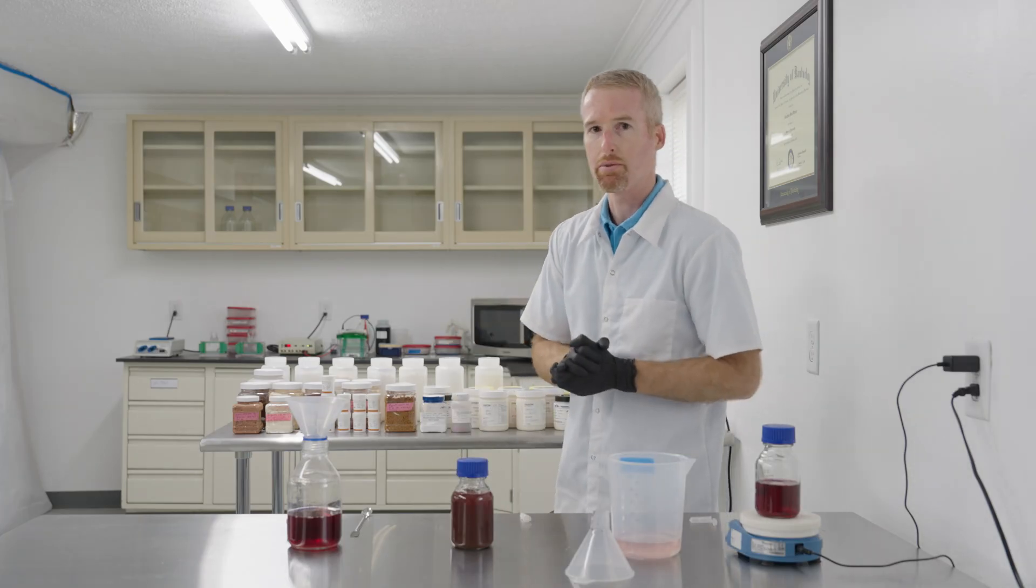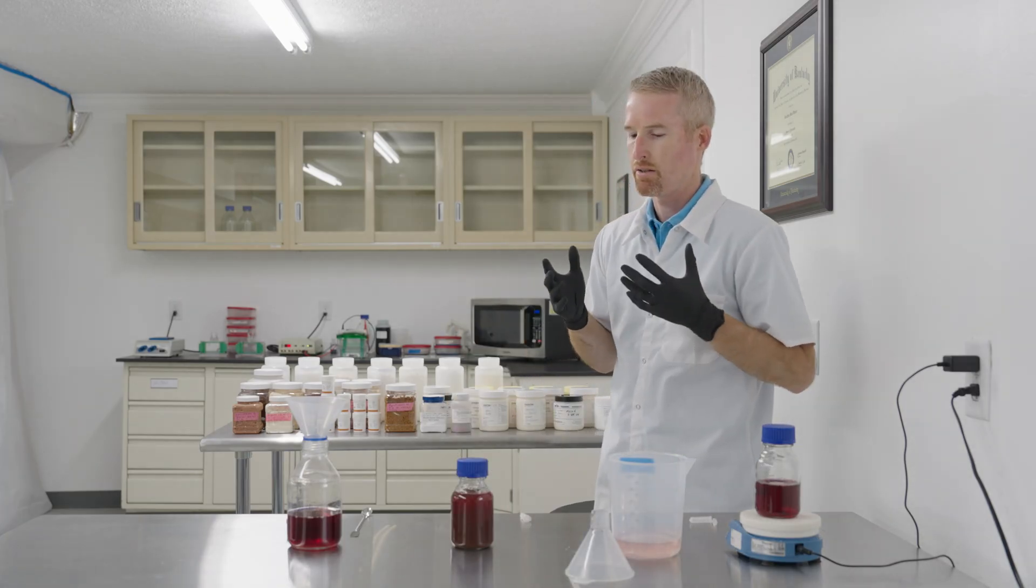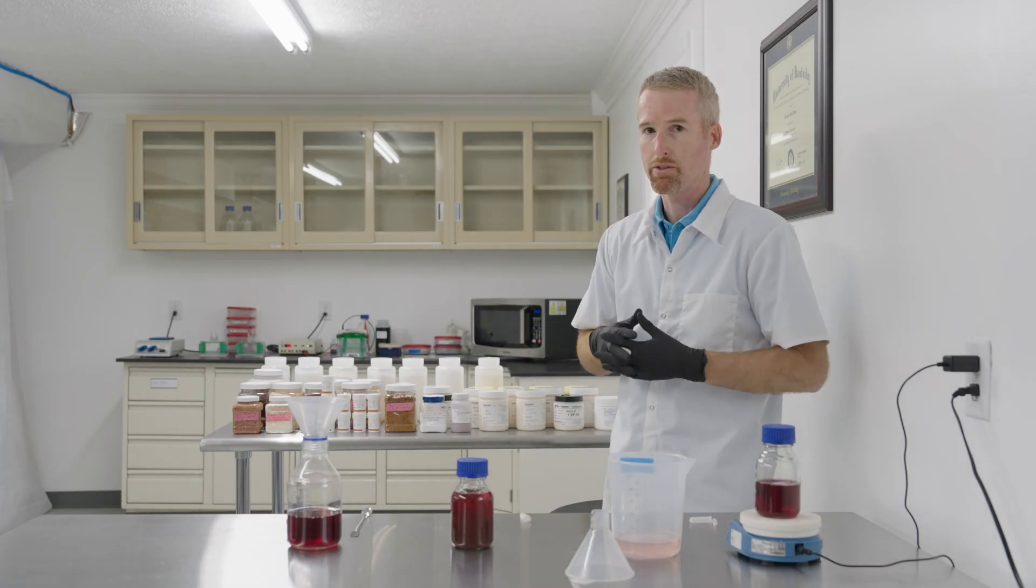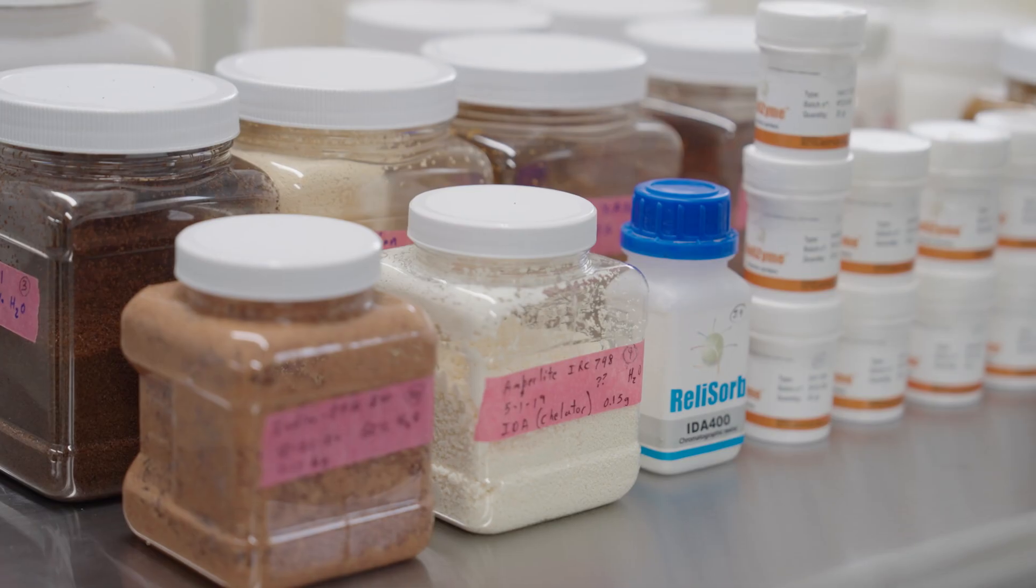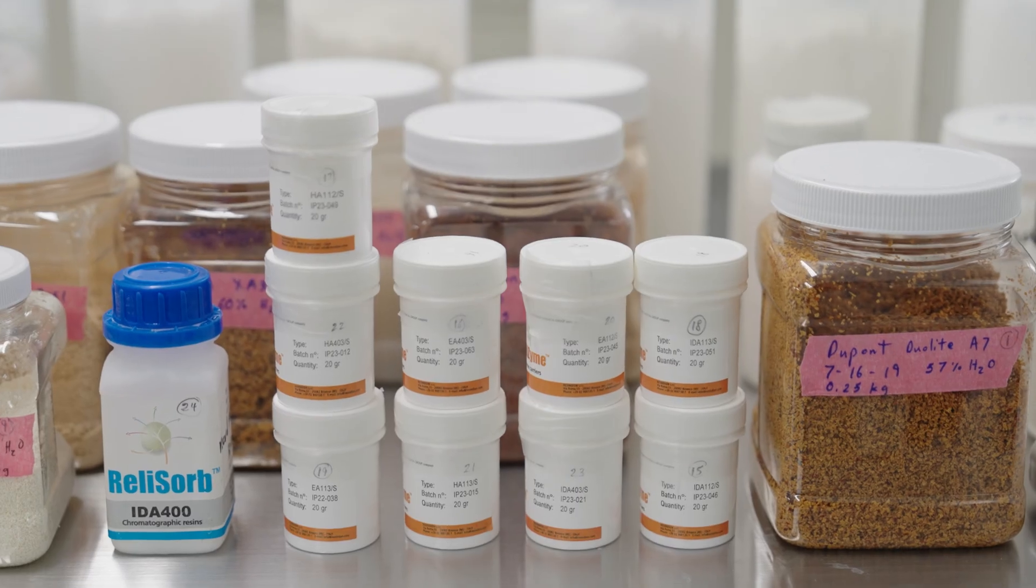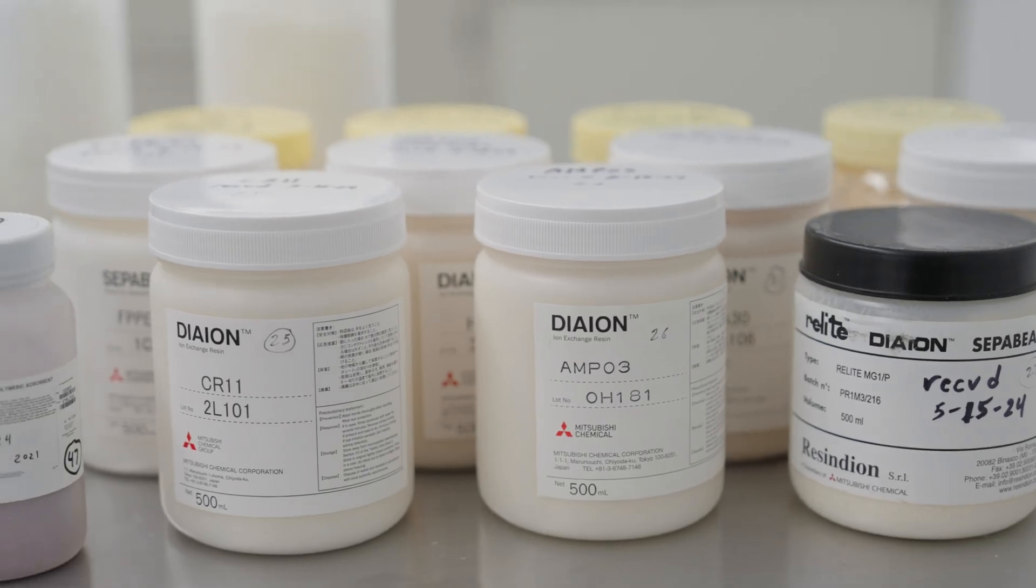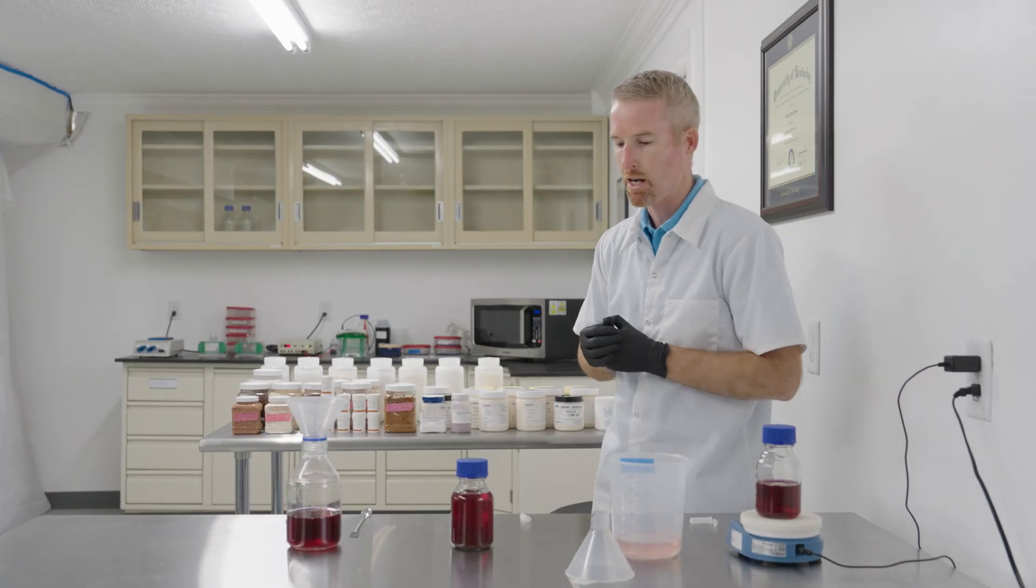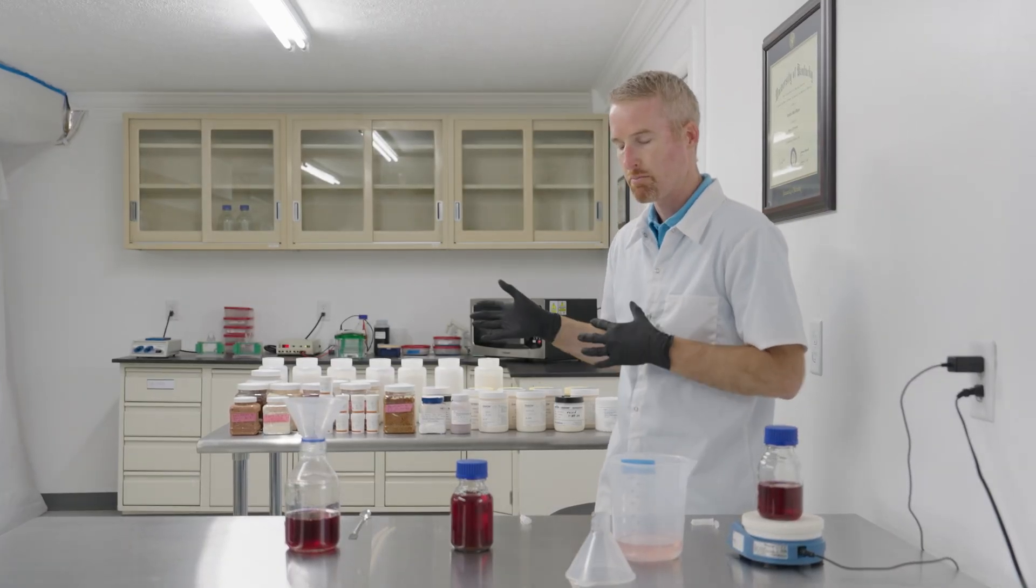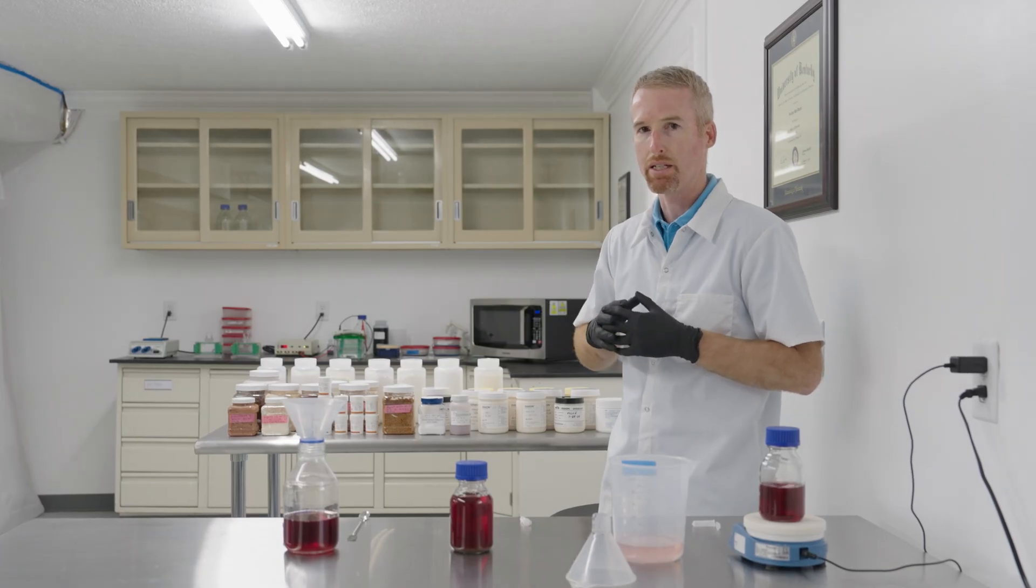Here at SolidZymes, we are a contract research service and we have a large collection of enzyme carriers—things like this brown material—but all of them will affect the enzyme in different ways.